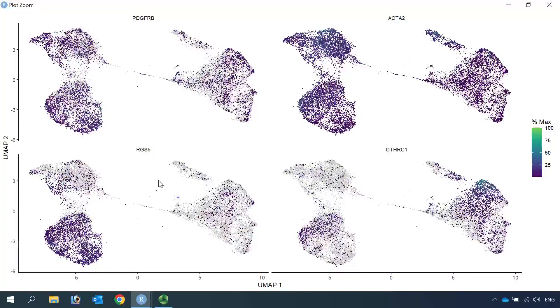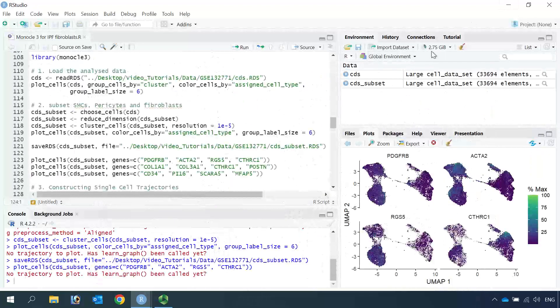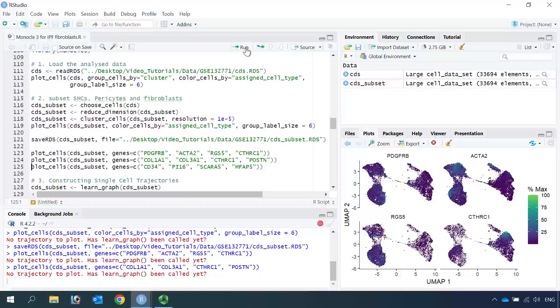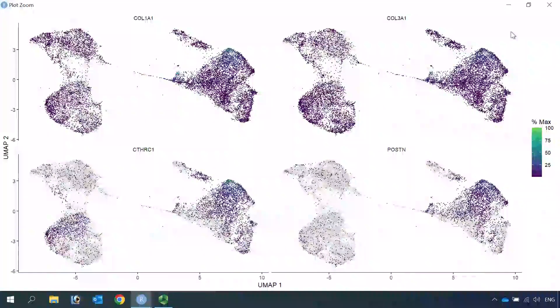RGS5 largely labels the pericyte cluster. More importantly, CTHRC1 labels the myofibroblast cluster within the fibroblast clusters and also labels pericytes in the fibrotic lung. CTHRC1 is one of the markers for myofibroblasts. We can also use other myofibroblast markers such as COL1A1, COL3A1, and periostin. You can see COL1A1, COL3A1, periostin, and CTHRC1 all have high expression in the myofibroblast cluster.